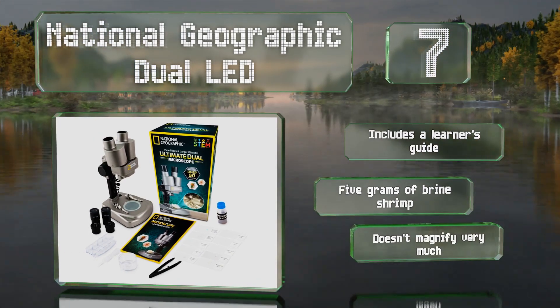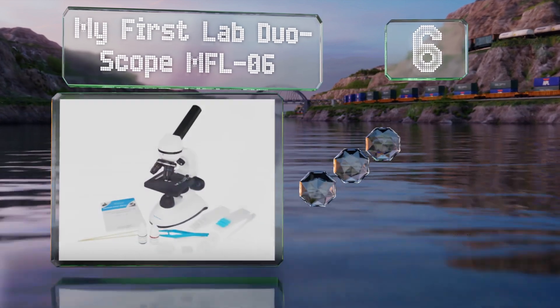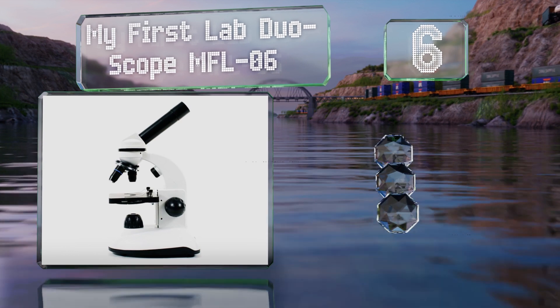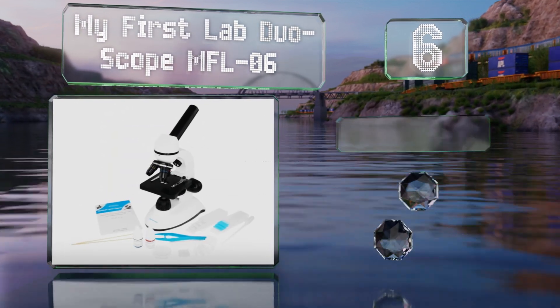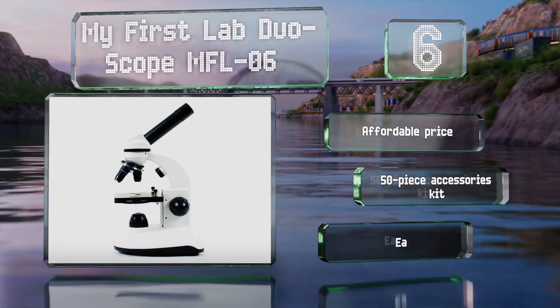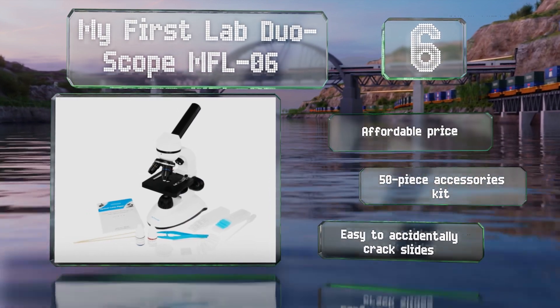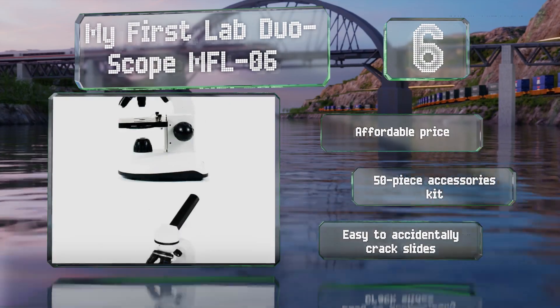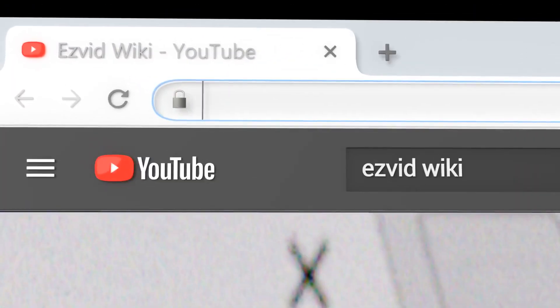Coming in at number six on our list, the My First Lab Duoscope MFL-06 bridges the gap between a toy and a scientific instrument. It offers a maximum magnification of only 400 times, but it operates just like a professional-grade model, so it's a good teaching tool. It comes at an affordable price with a 50-piece accessories kit; however, it is easy to accidentally crack the included slides.